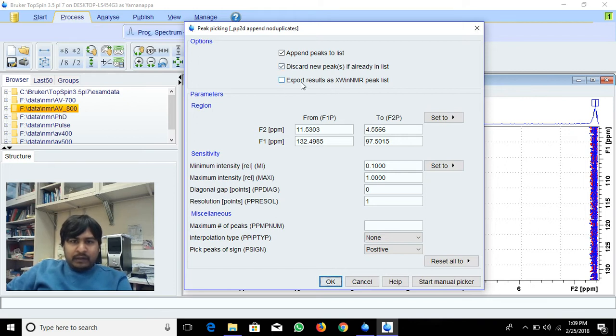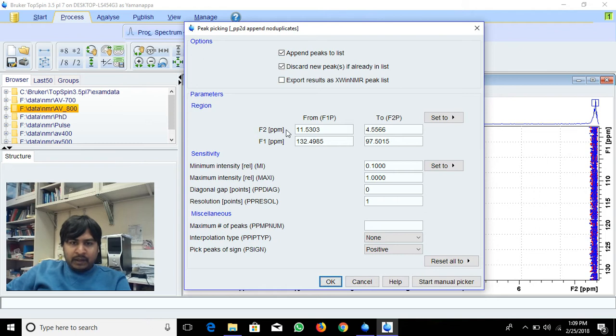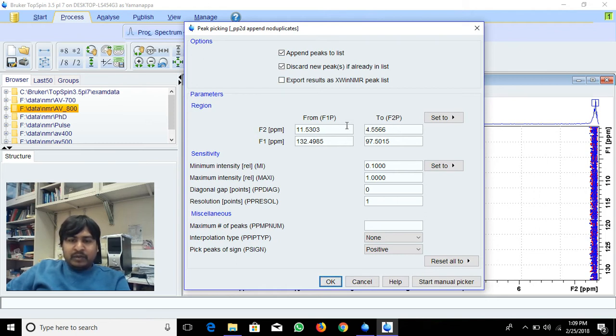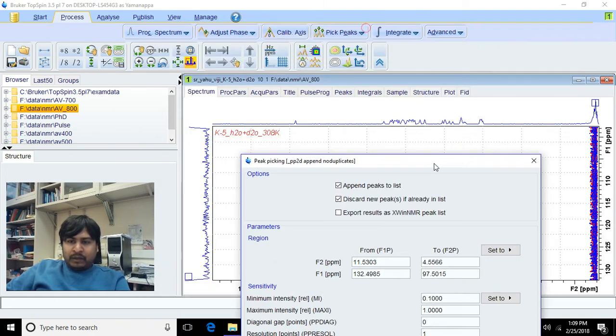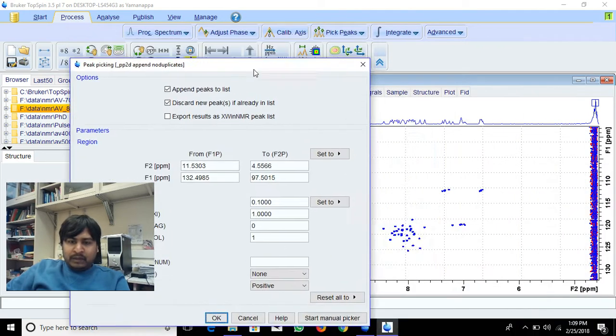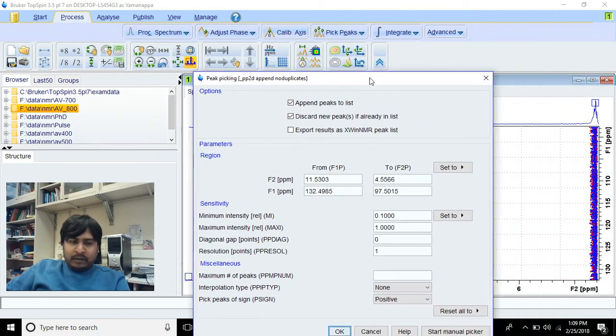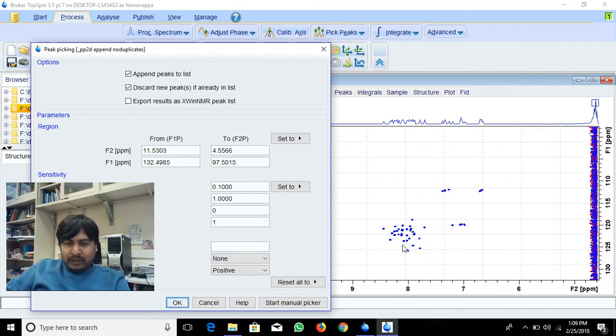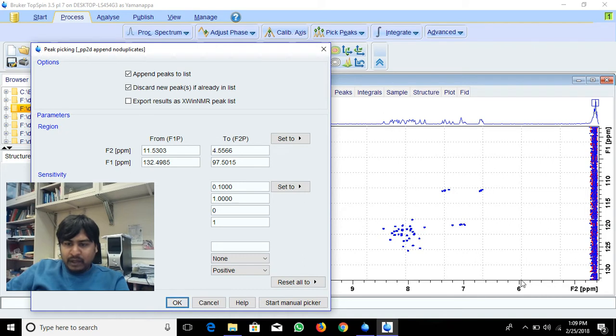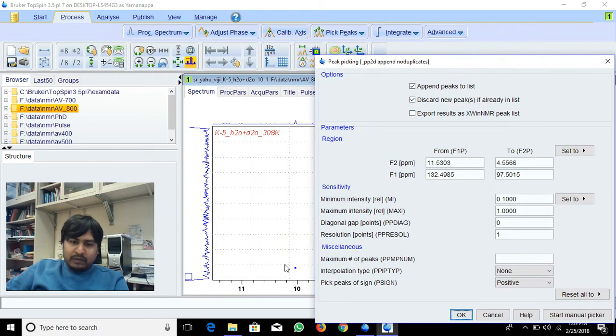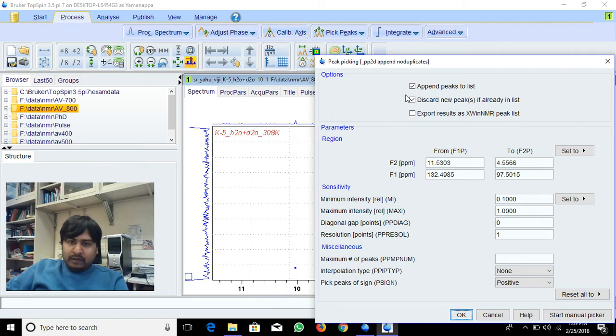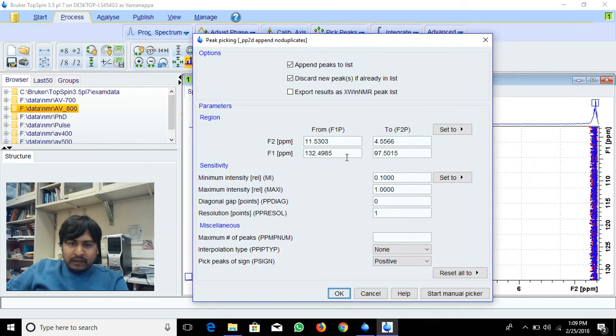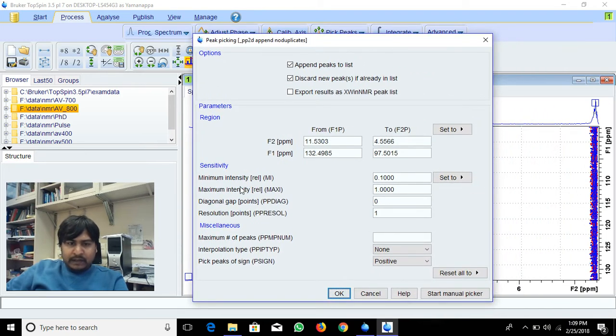Here you can export results as explained in NMR and append lists, and you can select from which PPM to which PPM you want to pick the peaks. If I want to pick peaks from only this region, I can give 9 to 7 so it will pick only this region. If I give 6 to 9 it will pick all this region, or if I want only this peak I give plus or minus 0.10 so it will pick only this peak.